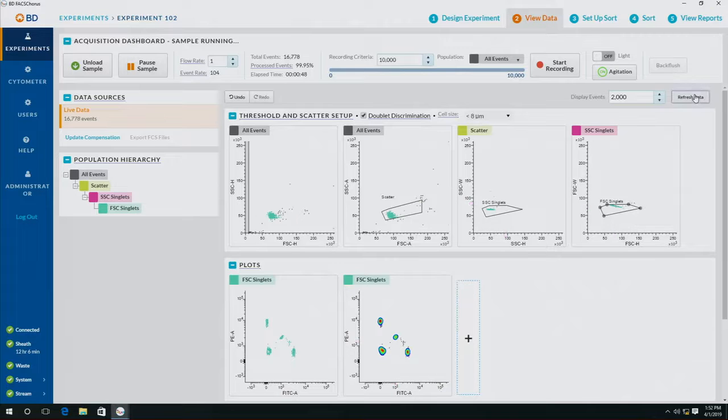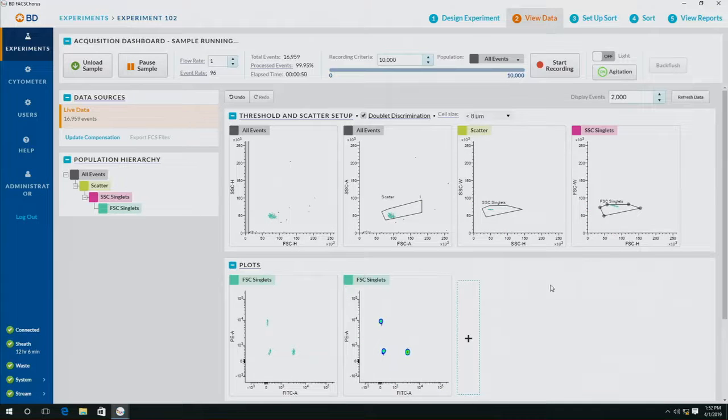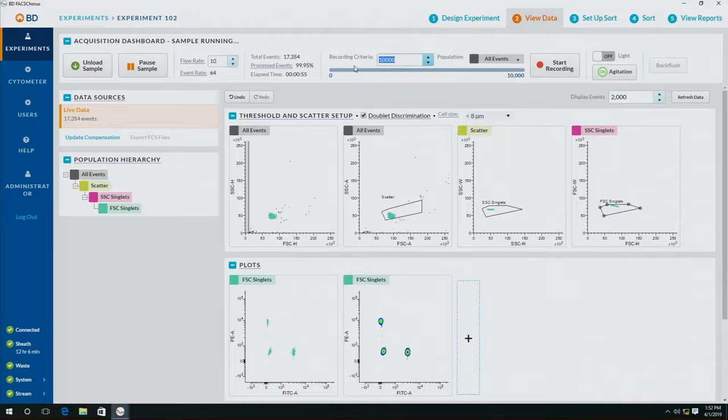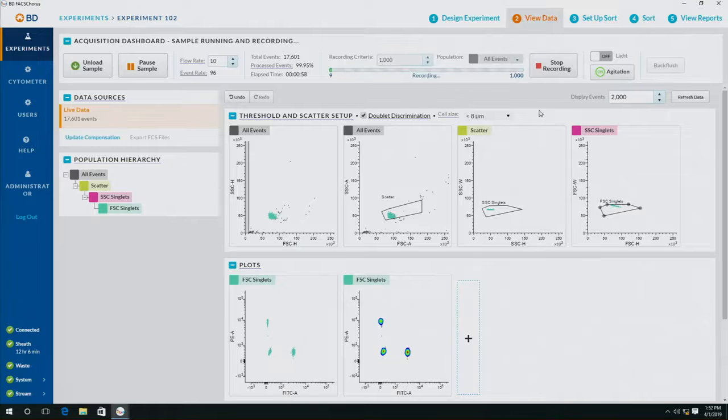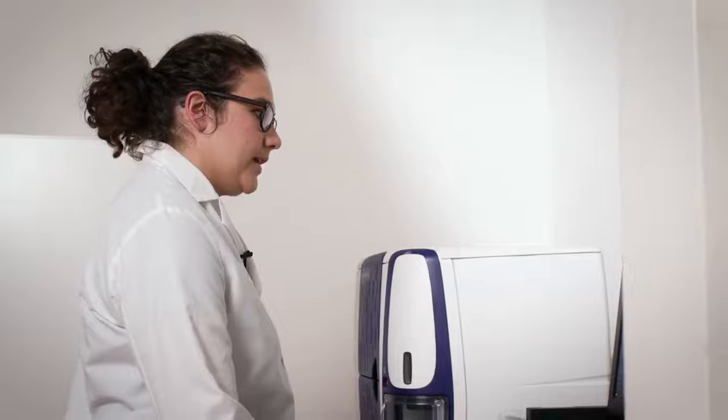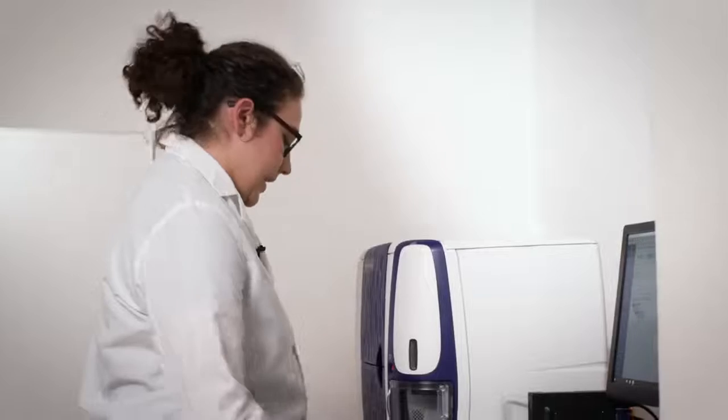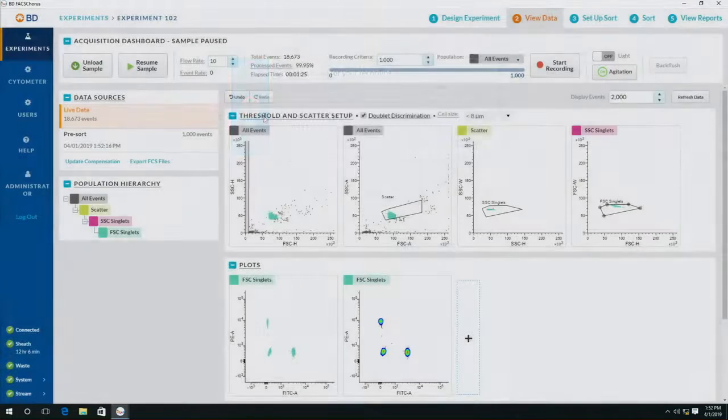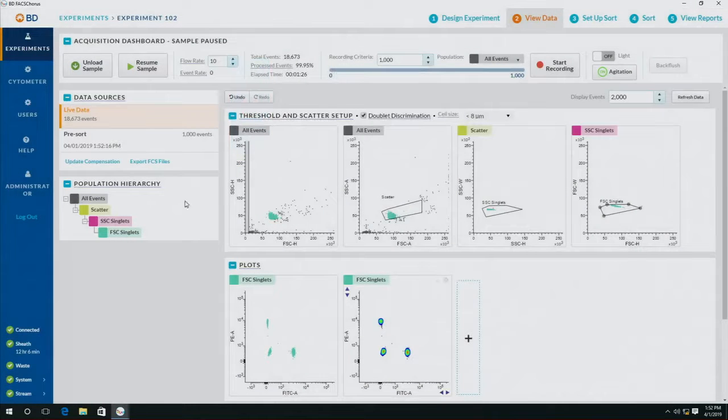and you can also run your own compensation controls. Once the settings have been set, we can start recording some samples. I'm going to record 1,000 events. I'm going to label the sample pre-sort.